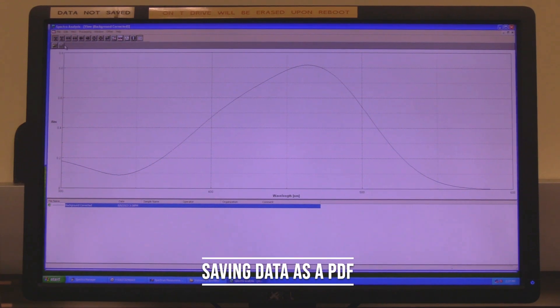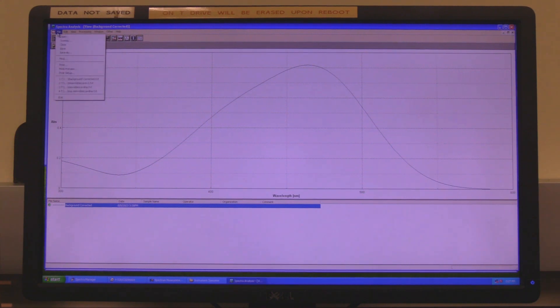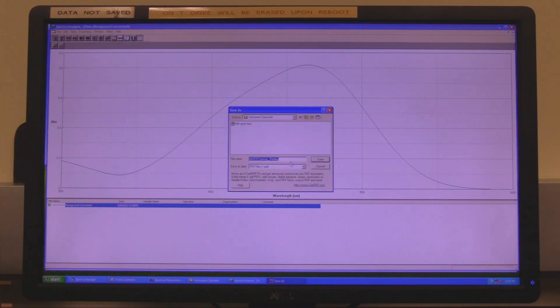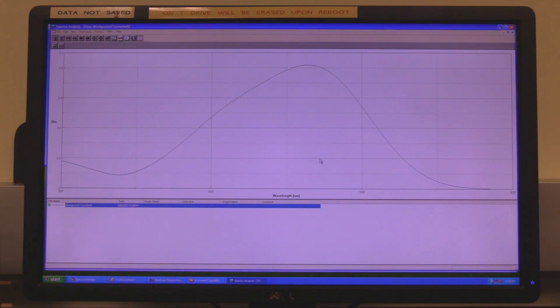Saving data as a PDF. Click on file and then click on print. The save as window will open. Find the desired folder, name the PDF file and click on save.